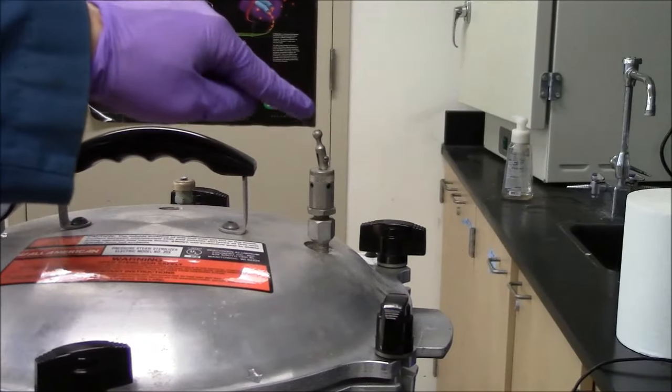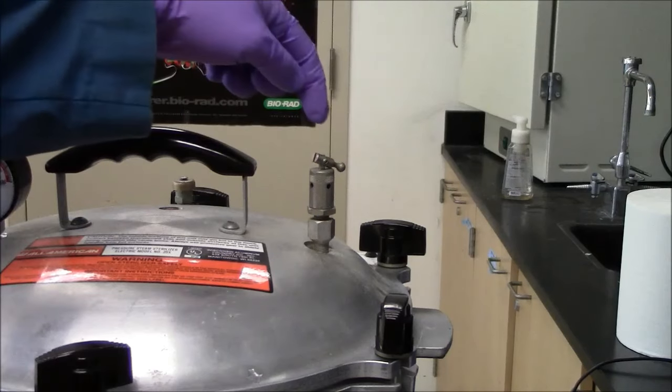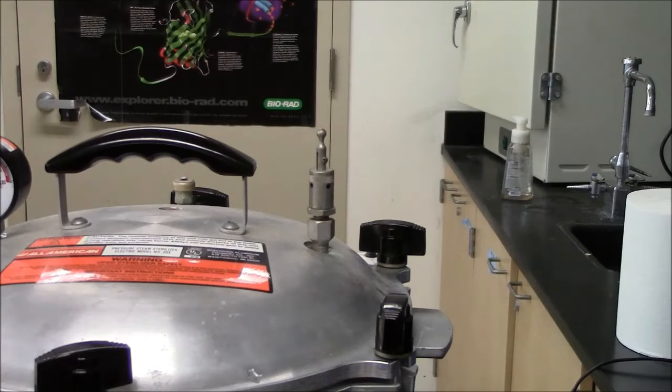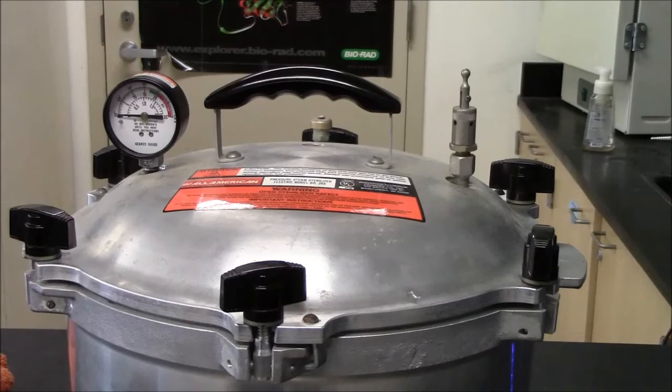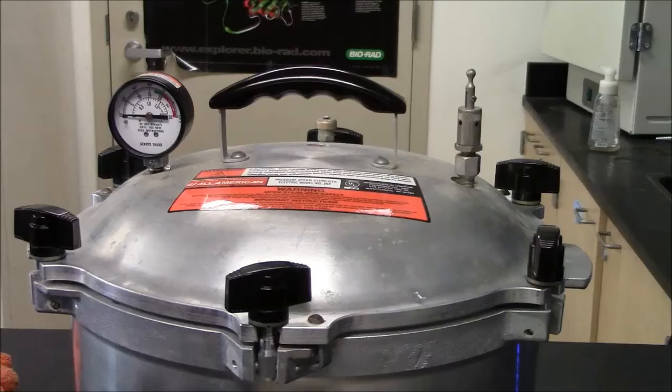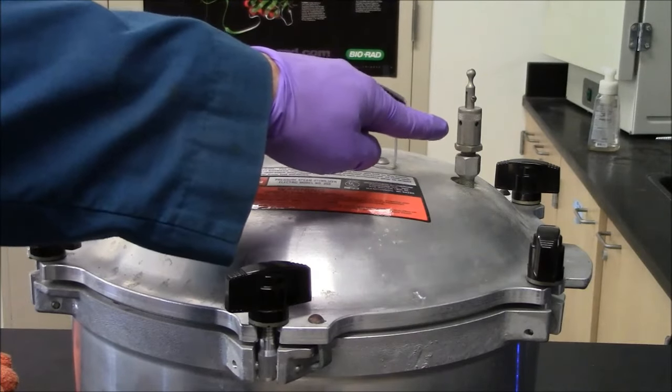Initially this lever here needs to be up. There's the down position. There's the up position. It needs to be up to allow air to escape. With the lid on, the water will start to boil. We should see steam up here.